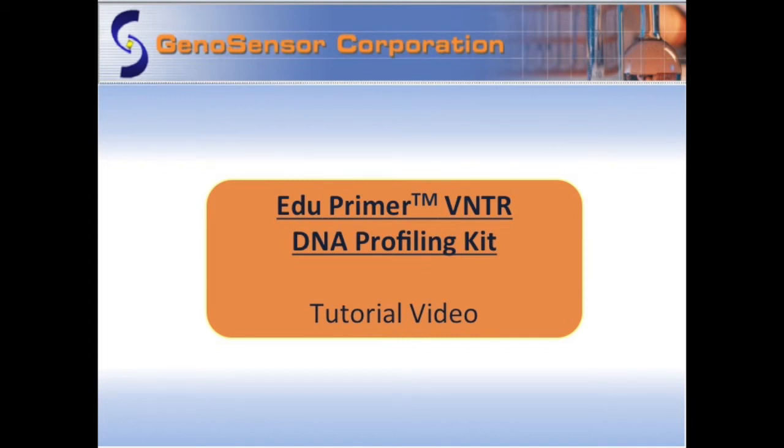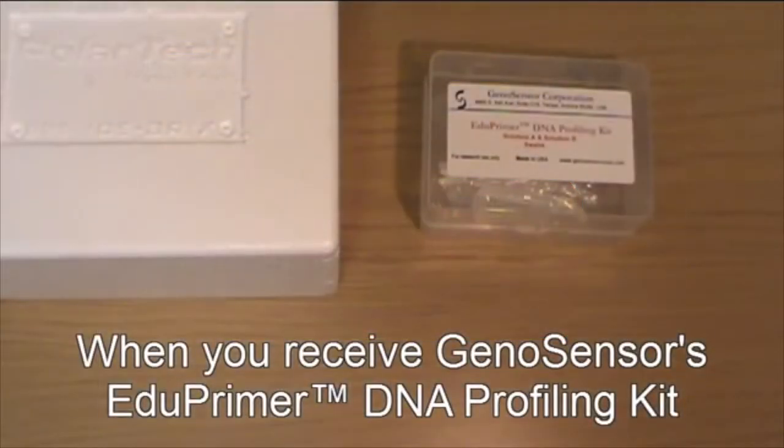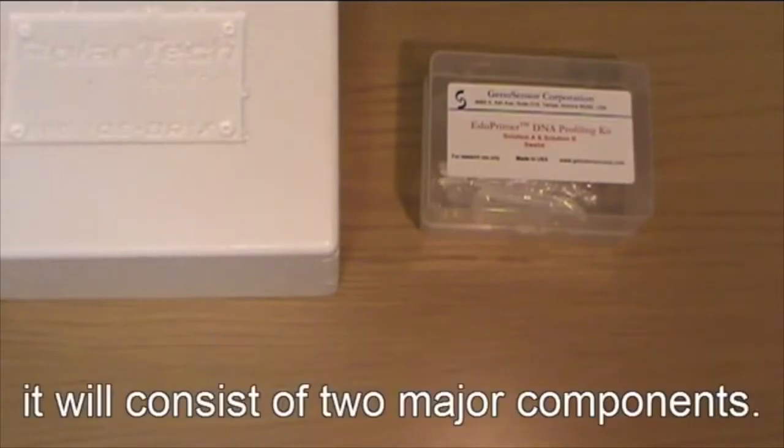When you receive GenoSensor's EduPrimer VNTR DNA profiling kit, it will consist of two major components.